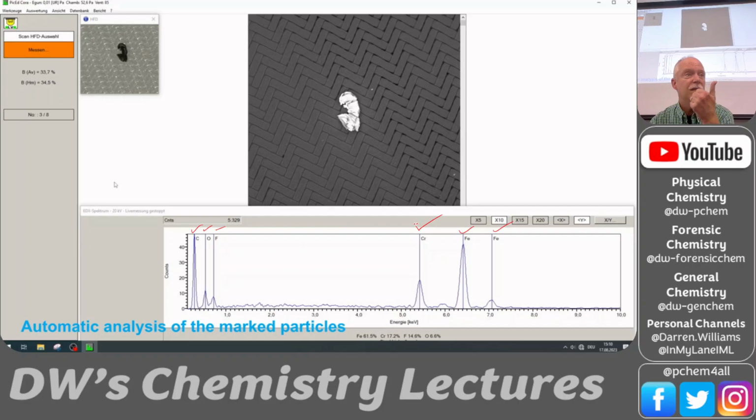Well, iron's the metal. So this is a metal particle, okay? But the chromium indicates it's a steel of some sort. And so they alloy iron with carbon. But again, you can't really depend much on the carbon signal because there's carbon everywhere. But the chromium indicates that that's steel.